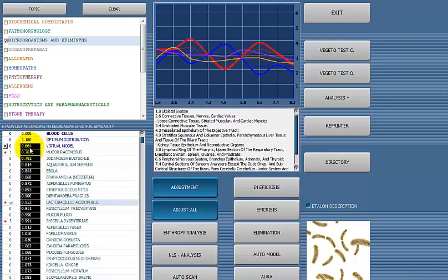We looked at the coefficients, these numbers here. We adjusted, which means that we clicked on the adjustment, which does a second evaluation of the coefficients, and if anything is missed, then it'll bring it to the top, which in this case there were many. And then the third thing we did was click on automodel, which brought up red dots and the infinity sign, which points to the most major problem.